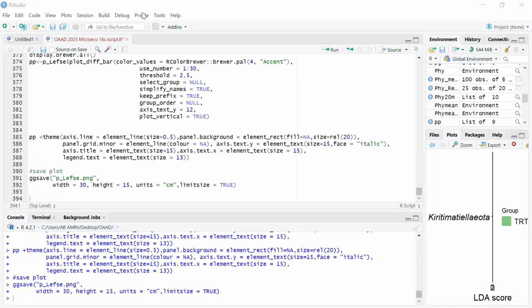Even, let me just relate this question to, for example, our volatile fatty acids, where we determine actual concentration rather than percentage concentration. I was advised by a reviewer that it's not entirely possible to know the actual concentration.